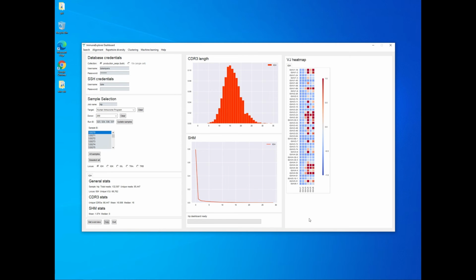So for example, the V region has one nucleotide that is different from the V germline sequence. And based on this plot here, with this little mutation from a B-cell repertoire, it's likely that we're looking at adaptive sequencing, which only includes a small portion of Framework 3 region. And therefore we're not able to accrue the number of mutations that we might otherwise expect to see.